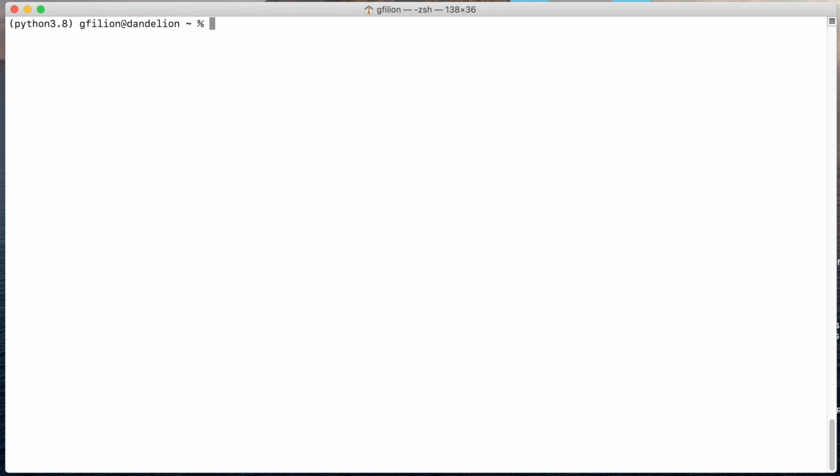Hi everyone and welcome. In this video I would like to explain the principles of discrete inference with Pyro. For context, I'm going to explain a little bit how FASTQ files work.